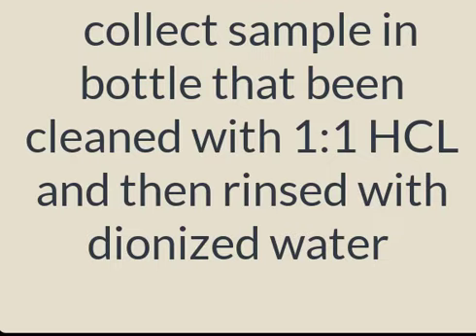Switch on your spectrophotometer and select the right program. The iron program is 265. Now rinse 2 sample cells with deionized water, then condition and fill them with your water sample. Add the contents of 1 FerroVer powder pillow to one of your sample cells. Swirl to mix your sample. Any extra undissolved powder will not affect the accuracy of your test.